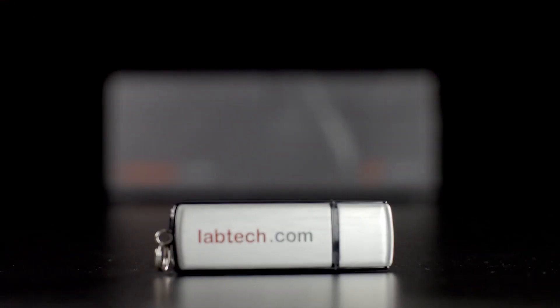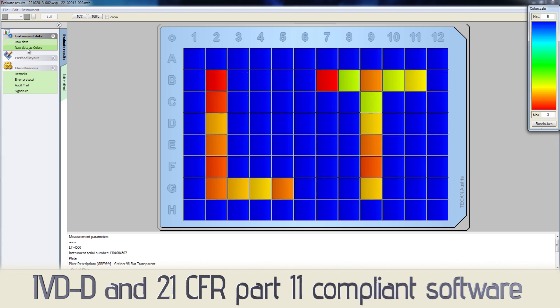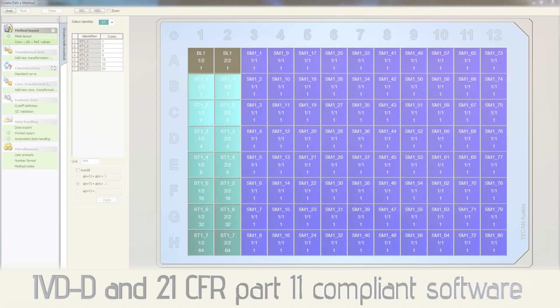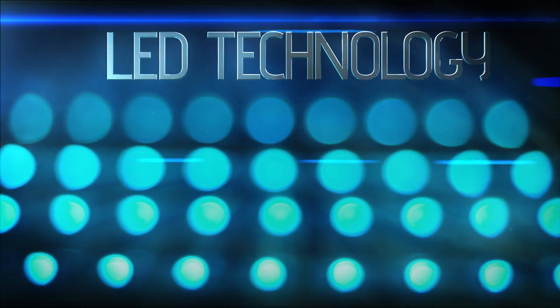With easy setup in minutes, using the supplied USB interface and industry standard compliant analysis software as standard, LED technology provides fast and accurate results with a maintenance-free service life.